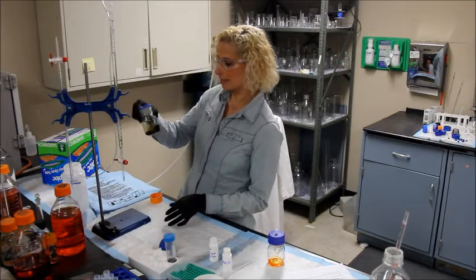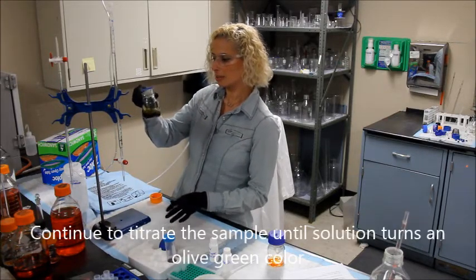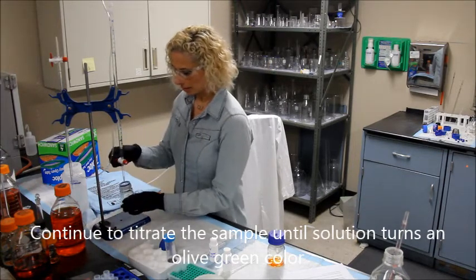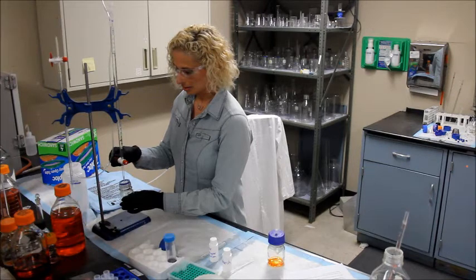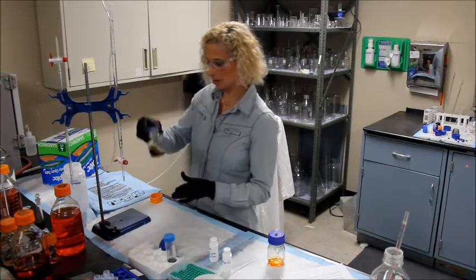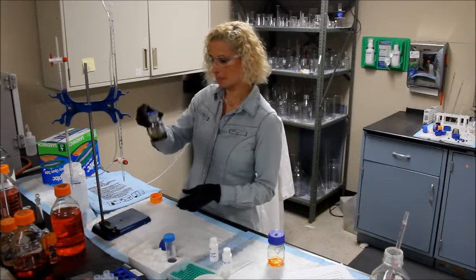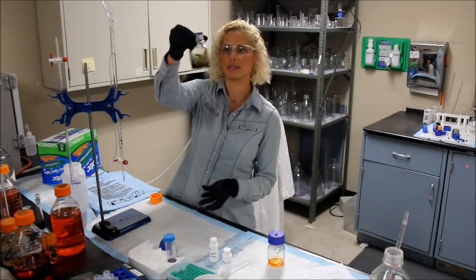You want to titrate the sample until it's about an olive green color. Not quite there yet. This is our olive green color.